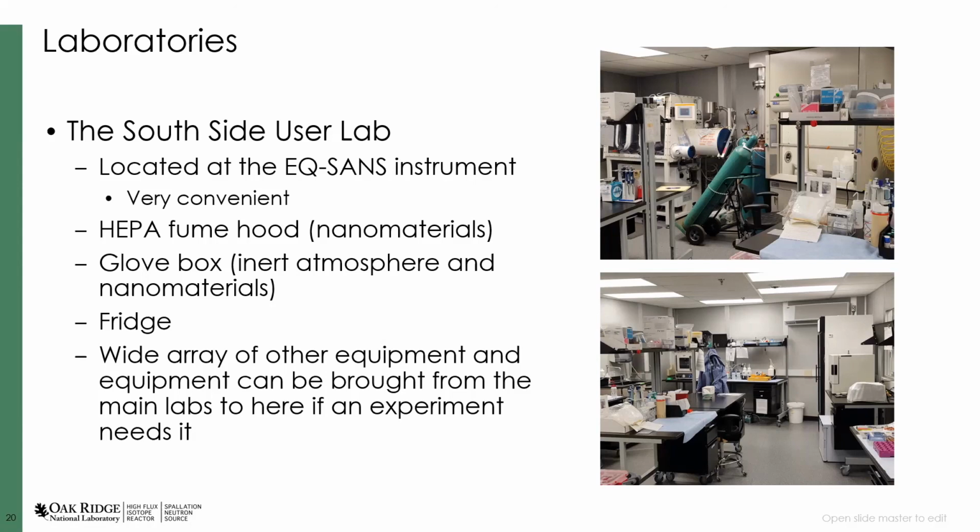Now, this laboratory is available to anybody who's doing any experiments in the SNS, but this one is, like I said, really convenient for the EQ-SANS instrument. It was actually part of the construction project for the beam line.